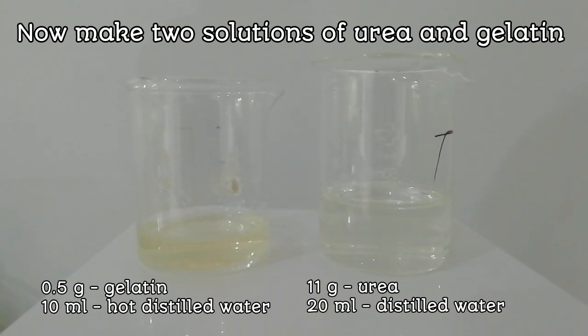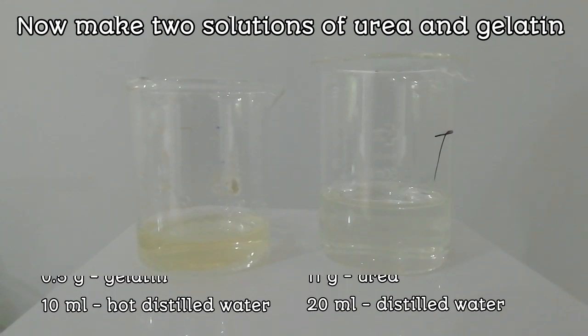Now, 11 grams of urea is dissolved in 20 ml of distilled water.